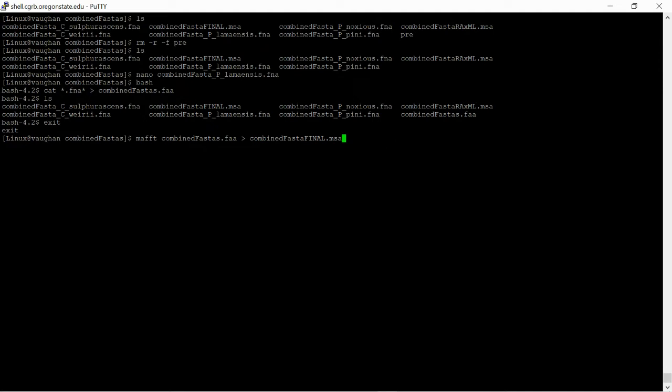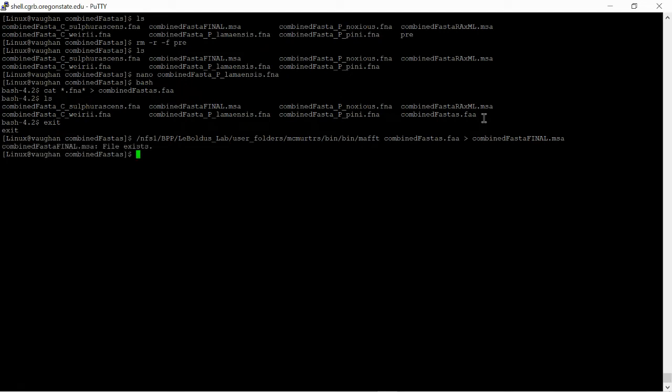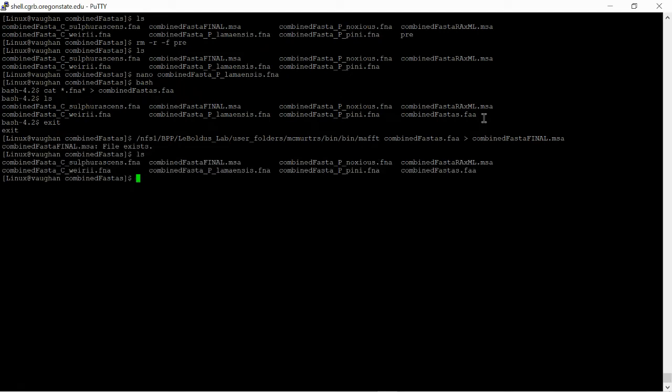For here, for just the purposes of this video, I'm going to use a separate command that's specific to the cluster at Oregon State University just to show that it runs. But like I said, you'll probably use just MAFFT, depending on how you install the program.